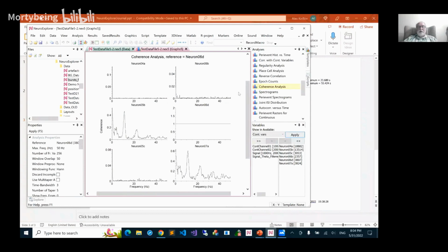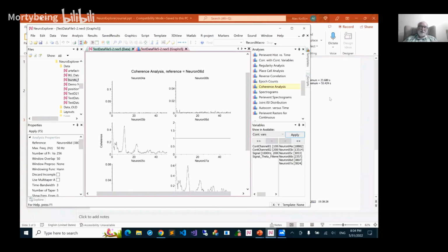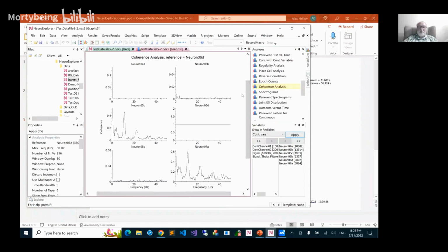Okay, so we have about 25 minutes left. We can go through some other features of the program, like what menus you use, how you do this, how you do that, instead of just going through analysis. That's why, when you ask me about a write-up on what features will be useful for your customers, you have to explain each analysis, maybe for you to explain it to the customer.